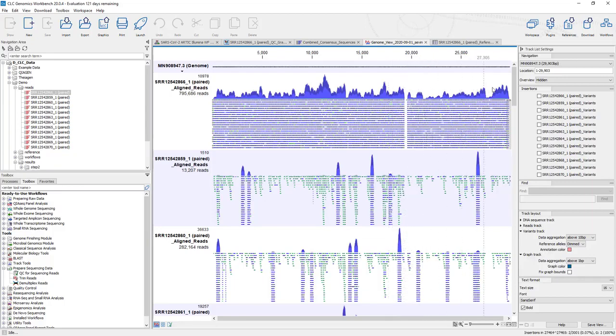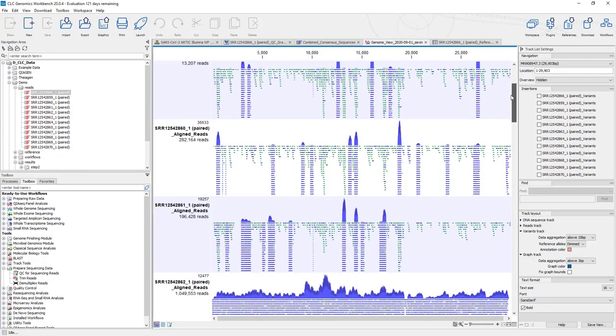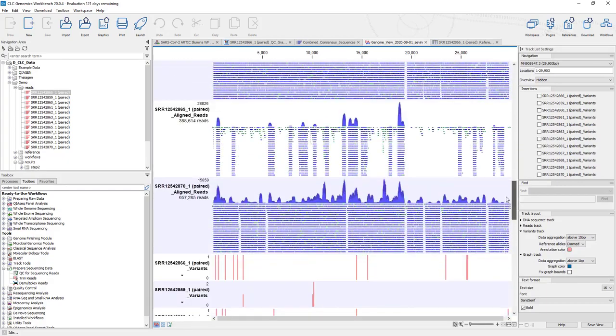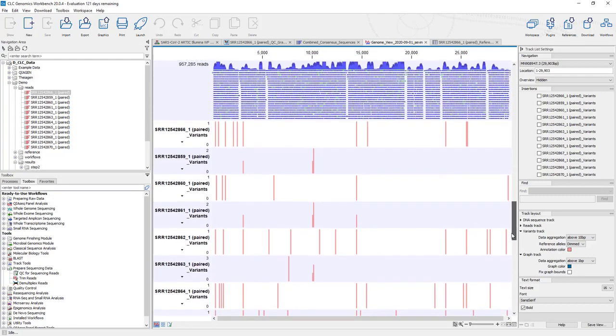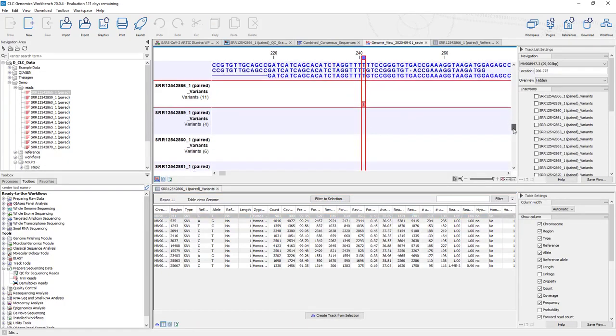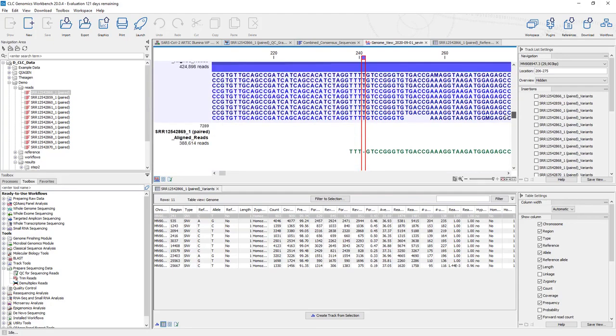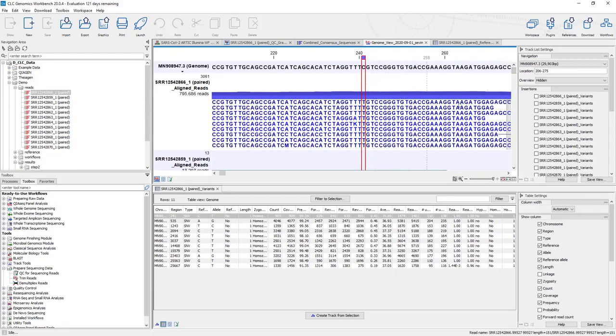And this genome view allows you to look at the coverage for each one of your specimens, the raw read mapping for each of these specimens against the genome, so you could get a visual measure of how good or bad the data is. And then also variant calls. And these variant calls can be used for further phylogenetic analysis, but in the genome view, what you could actually do is look at your first specimen, get a list of variant calls, and then visually confirm the variant call and see if that variant is shared amongst other specimens, and then the alignment data against the reference that's used in support of these different variant calls.